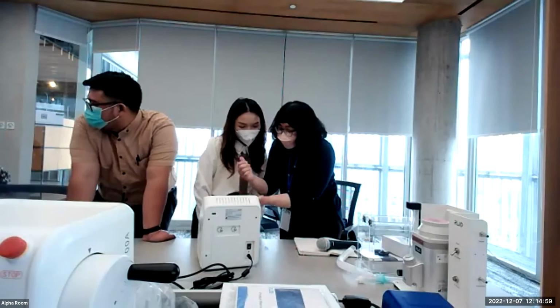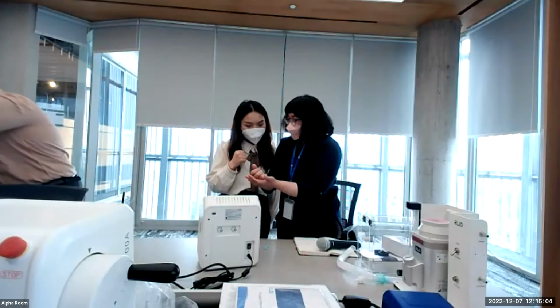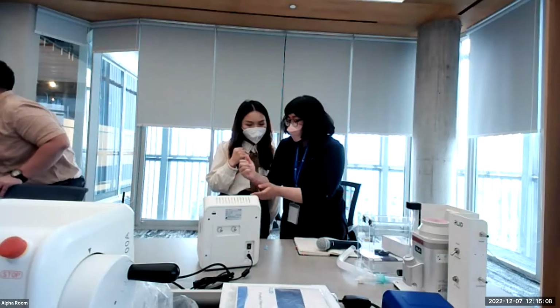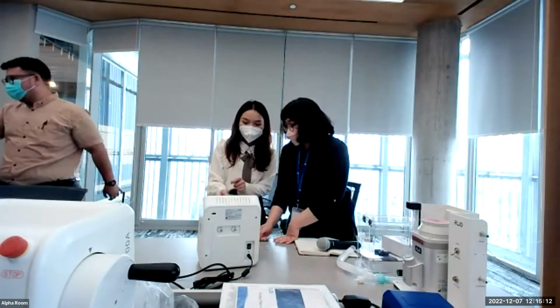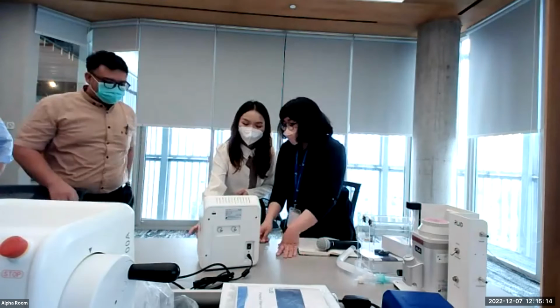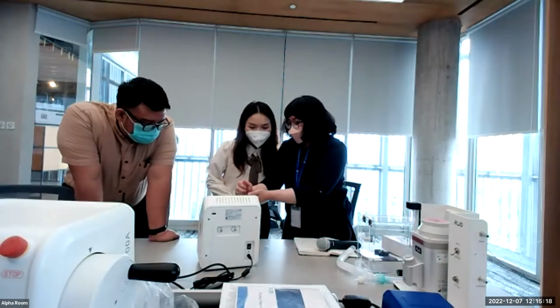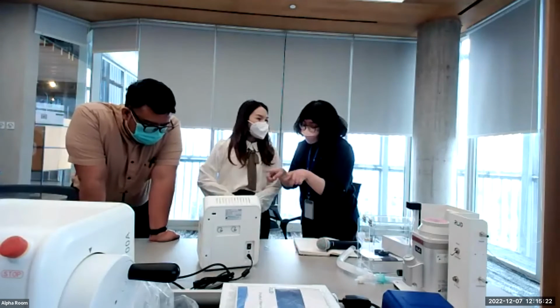So we mix the sample and trypan blue first, and then dispense into the slide. Usually we don't dispense the sample and then mix the treatment in the slide, I mean on the slide.